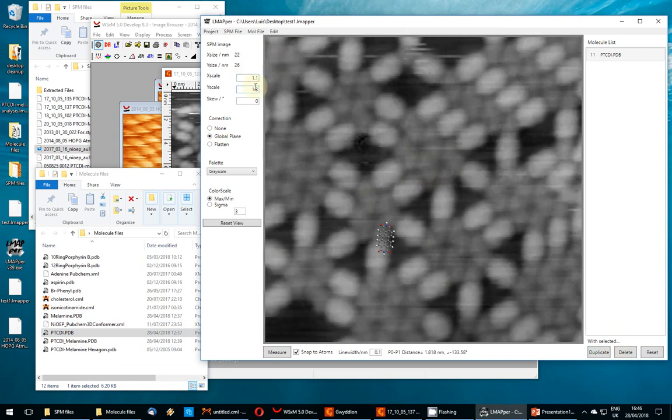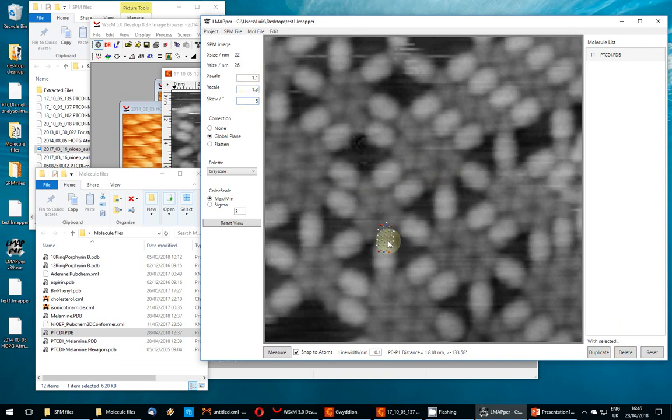Slightly annoying. Depending on the drift, it's normally 5. Sometimes the problem with the piezos is the electrodes not being perfectly aligned at 90 degrees. Okay, and it's a combination of two here. Oops, maybe like this. Not like this. Yeah, here you go.